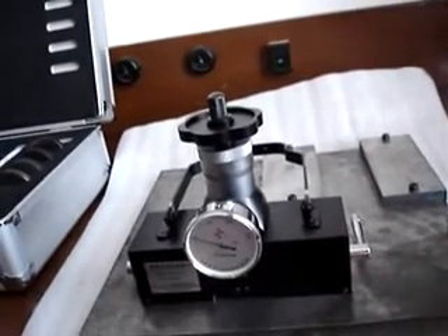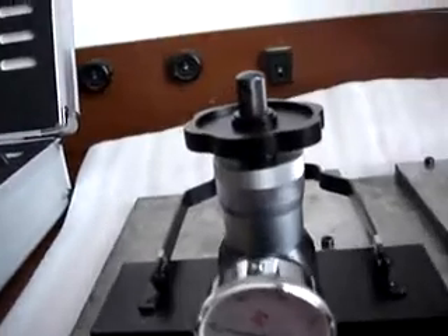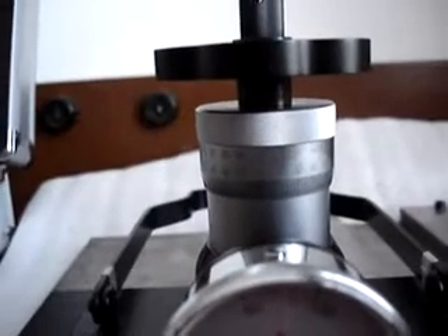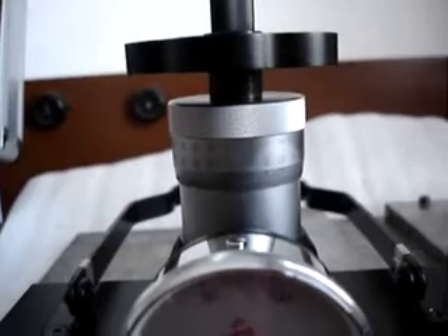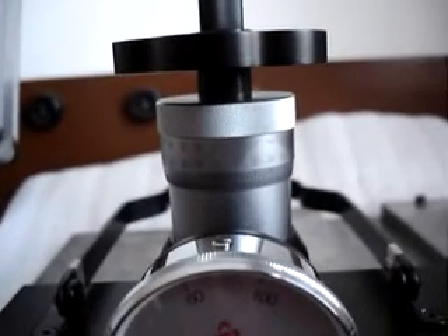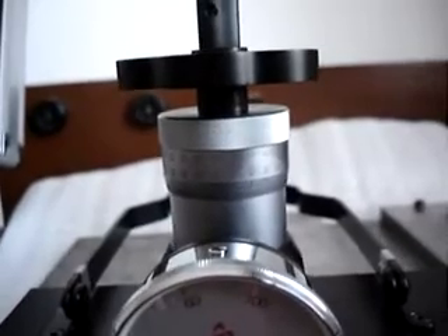Then take the hardness reading. The hardness number where the scale mark on the dynamic barrel dial is aligned with that of the static barrel dial represents the hardness value of this test. Read the number and estimate the reading to 0.5 hardness unit.